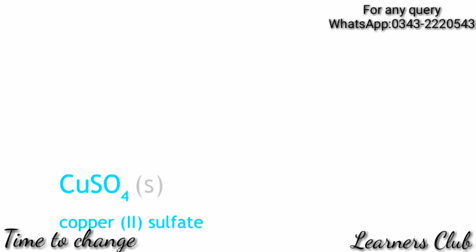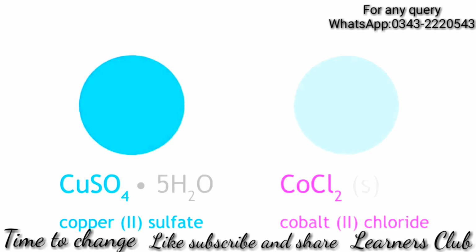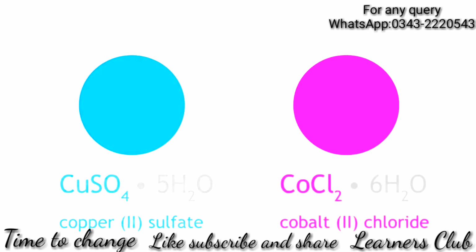In summary, anhydrous copper 2 sulfate and cobalt 2 chloride can be used to detect the presence of water. The color changes observed are off-white to bright blue for copper 2 sulfate and light blue to pink for cobalt 2 chloride.